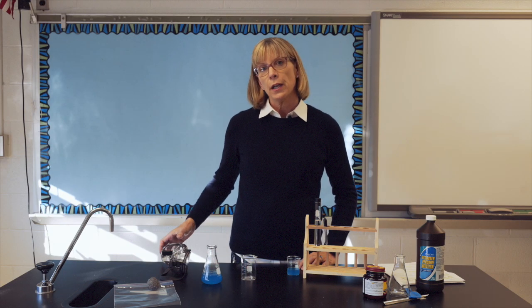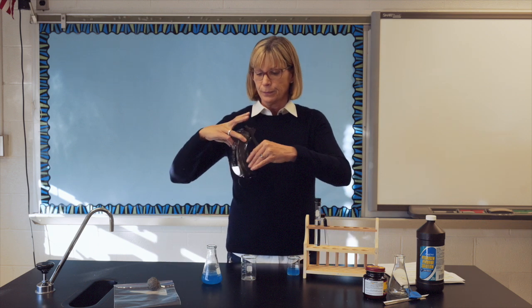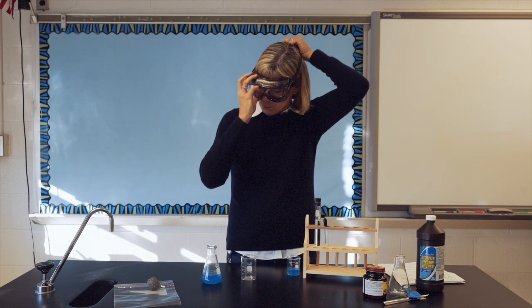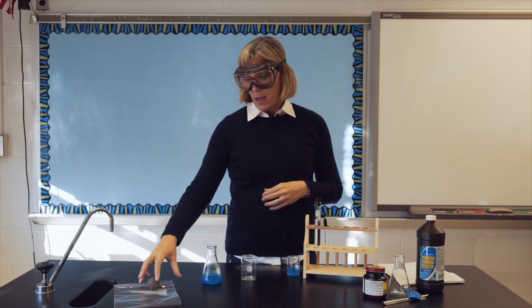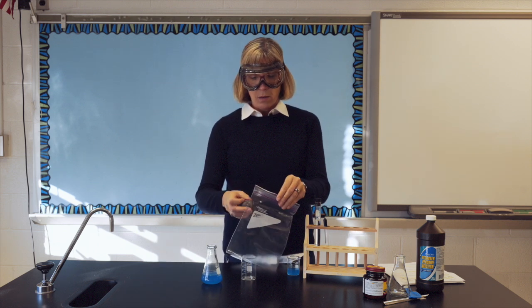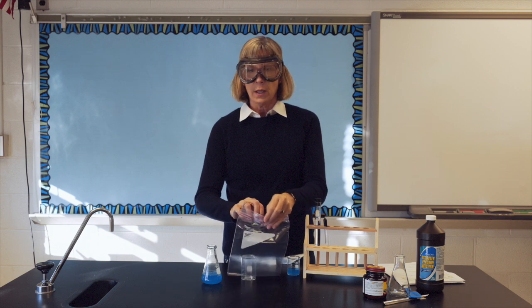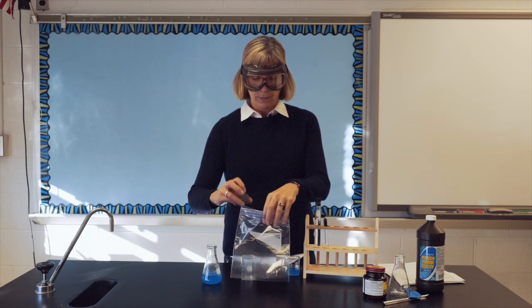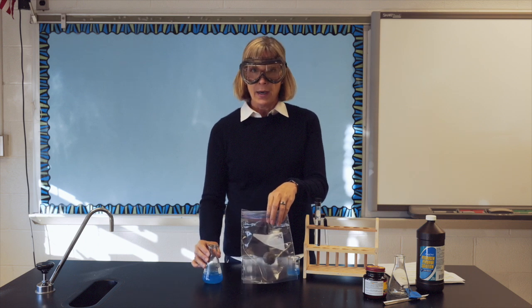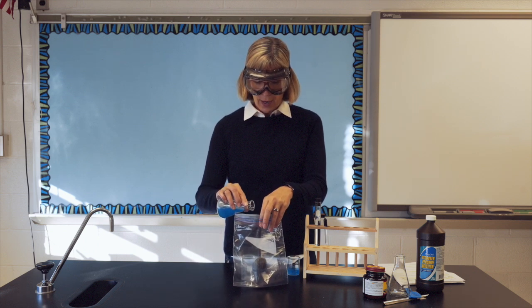Beginning the activities, I need to put my goggles on. For activity A, I'm going to put a wad of steel wool into the baggie and add 20 mLs of copper sulfate.